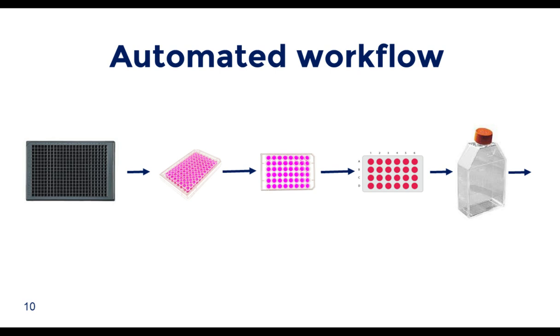The use of liquid handling robotics allows easy integration of 384 well plates at the beginning of the workflow. This instantly increases density of clones fourfold, allowing more clones to be produced in the same area or retaining the same level of clone production in a smaller area. This can provide space for more cell line development projects, permitting development of cell lines for multiple candidate molecules in the same footprint as one candidate molecule, and allowing cell line development to begin sooner.